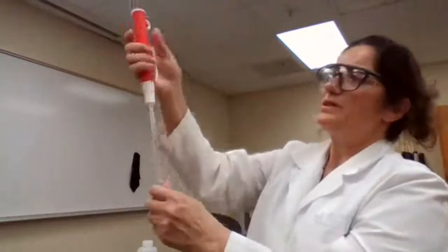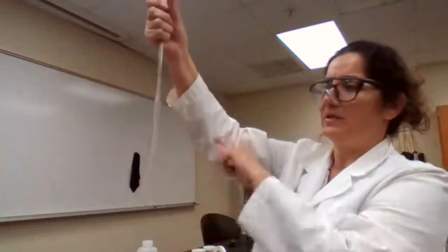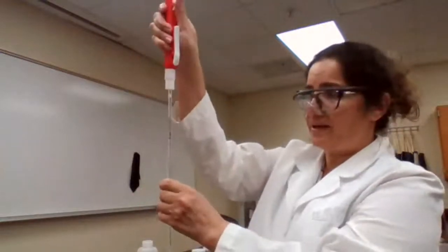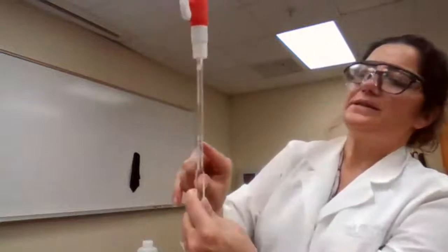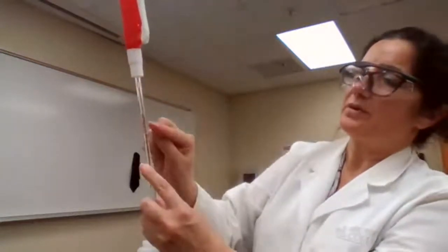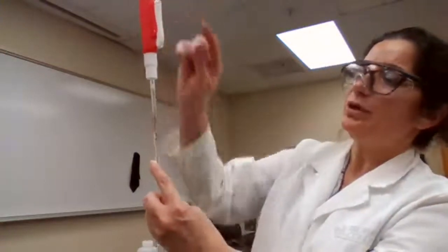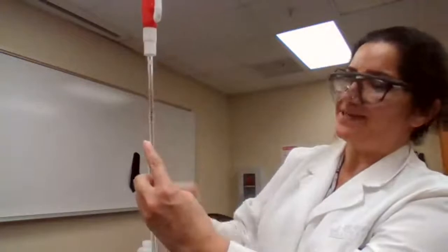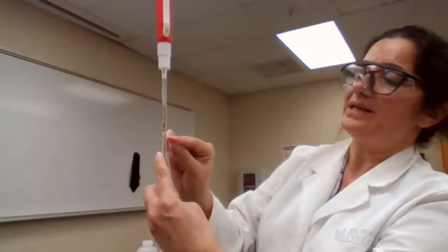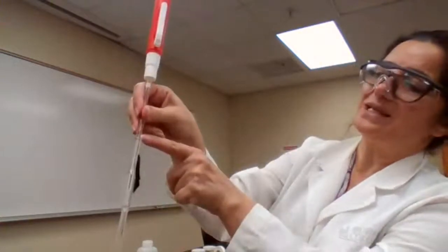Place the tip of the pipette inside the water and wheel down to draw the liquid in until the index line. First I draw more than the index line, so it goes higher. Then slowly I dispense some to make the meniscus align with the index line, and that shows 5 milliliters because it says here 5 milliliters.